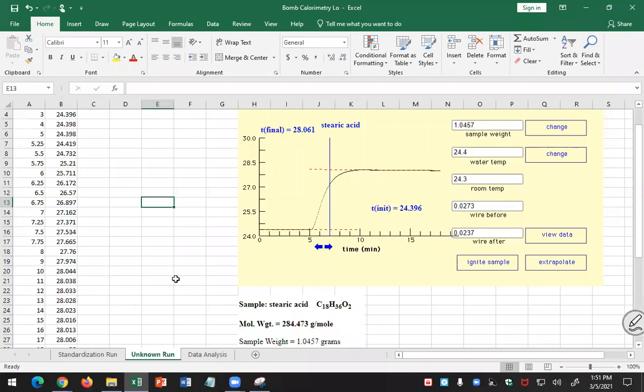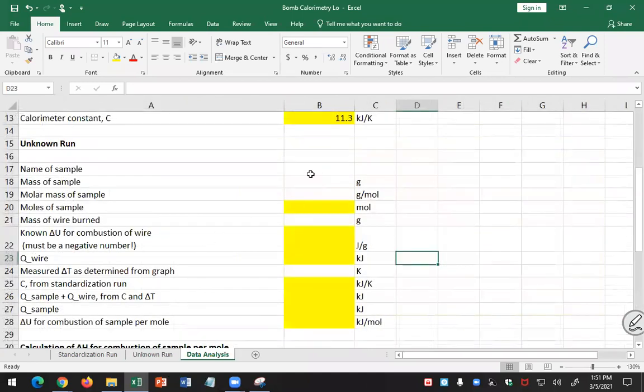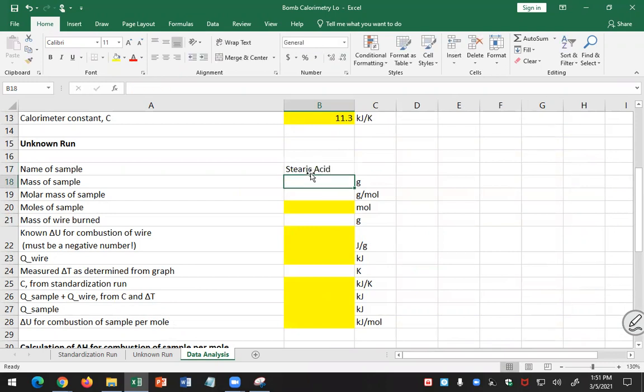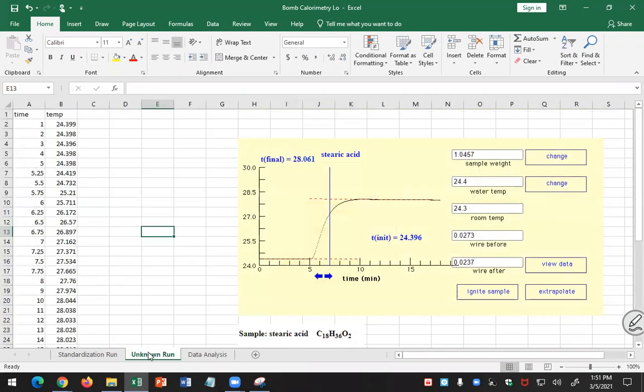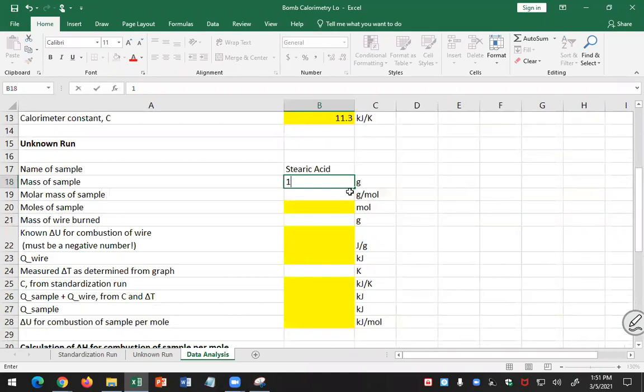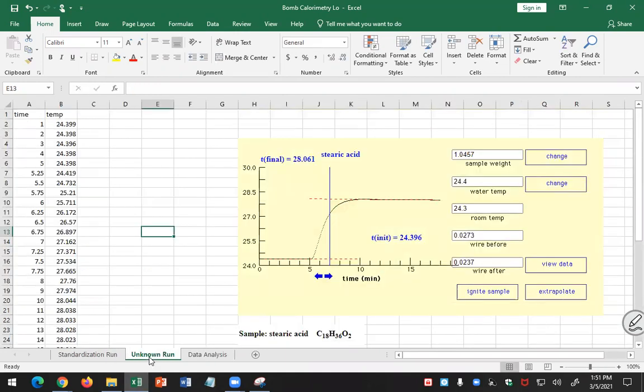Okay, so now for the unknown. The unknown that I used was stearic acid. So I'm going to put my name of my sample here, stearic acid. And the mass of my sample was 1.0457. And like I said, you can just copy my numbers for now and replace it with your own data. 1.0457 grams for my unknown run.